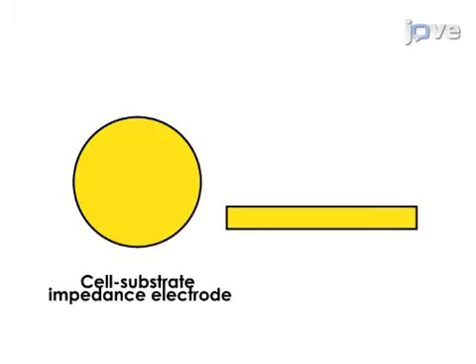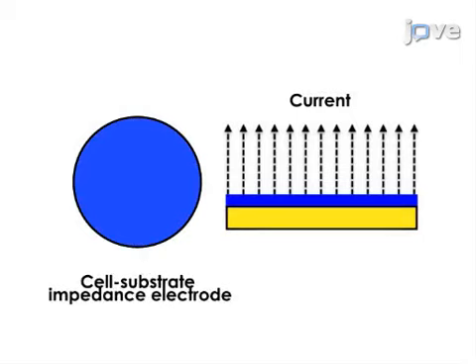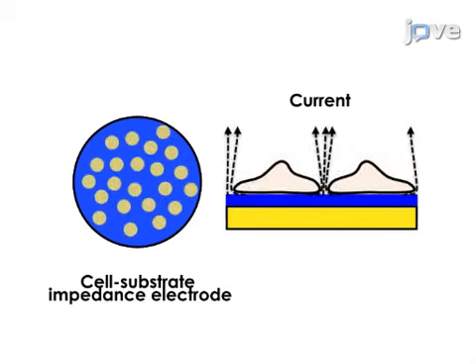This is achieved by first coating surfaces with fibronectin to provide an adhesive matrix substrate. Myeloperoxidase, or MPO, is then allowed to bind to the fibronectin. Next, suspended endothelial cells are seated onto the surfaces and incubated to attain maximal cell attachment and spreading onto the fibronectin. Then, the cells are exposed to hydrogen peroxide in order to initiate MPO-mediated fibronectin oxidation.